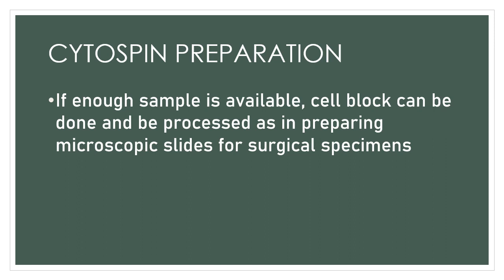With this, I actually did this when I was an intern. Here, the sample is a pleural effusion. Since there was quite a lot of it, like the container of your NSS, normal saline, that is used in the hospital, that is the vial we received in the laboratory.